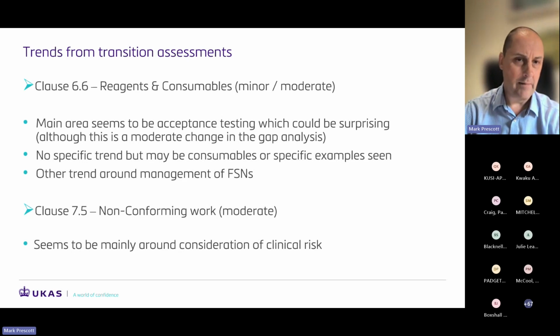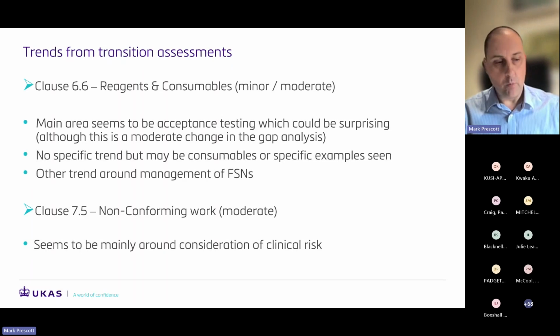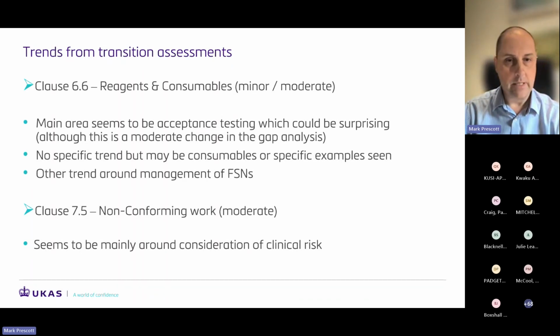But one other potential area of trend here is around field safety notices. We're certainly getting quite a few findings about how laboratories are managing those. And the final trend within there is non-conforming work, incident management. This again is classed as moderate on the gap analysis.